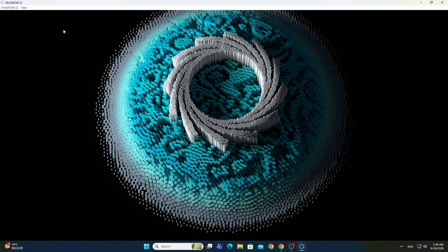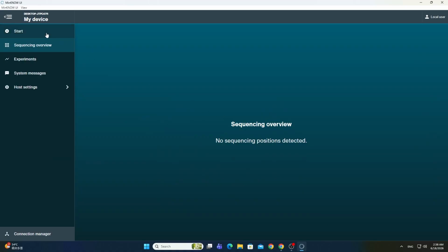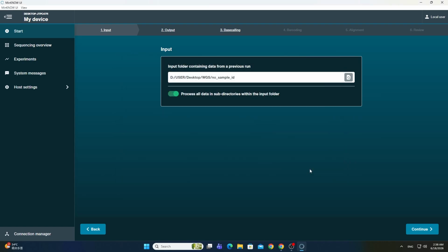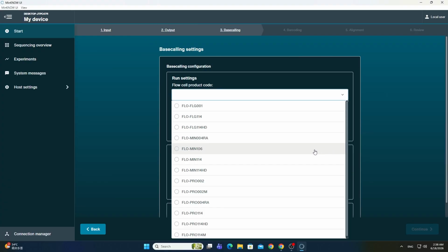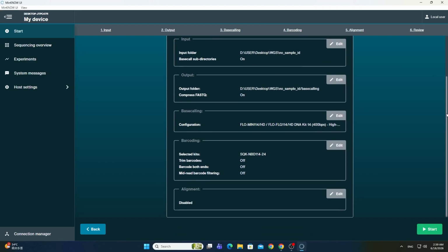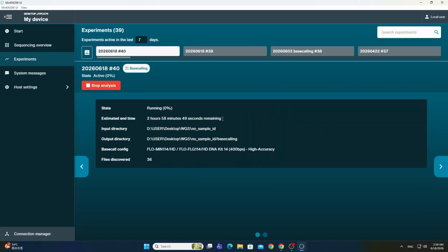First, we base-call the sequence raw data in Nanopore platform. Select the file where we have our Nanopore raw data. We select the settings following the materials we used during sequencing. Final check on the base calling settings and start. Here shows the status and the time remaining for the process.